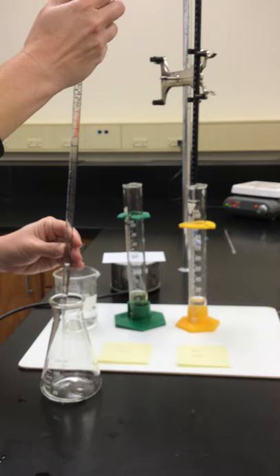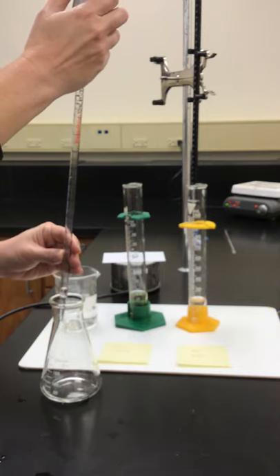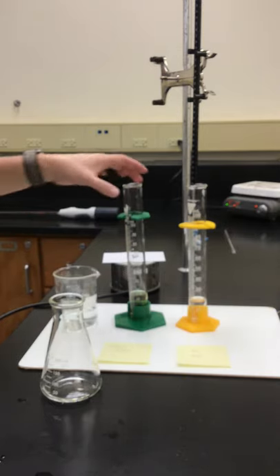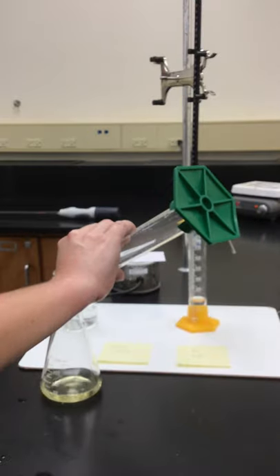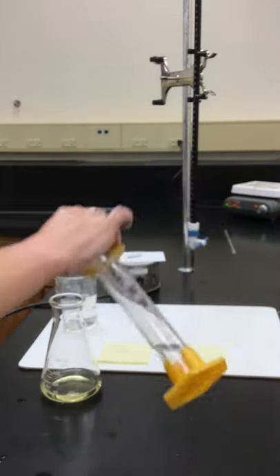Here is our 10 milliliter portion of our hydroxylamine. Then we're going to add 25 milliliters of our iron(III) chloride and about 20 milliliters of distilled water.